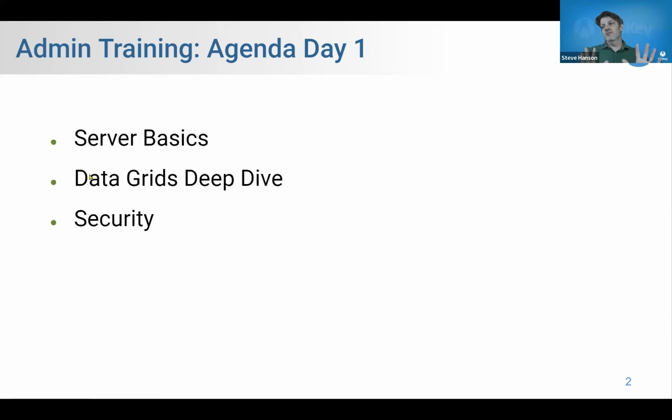I also want to leave a lot of time for Q&A after all of these topics. And that's where you can use the chat feature or the Q&A feature inside of Zoom here. Will, what do you prefer? Is Q&A better, I think? Use the Q&A feature, I think. And as we go, we'll call those out, and I'll try to answer them as best I can.